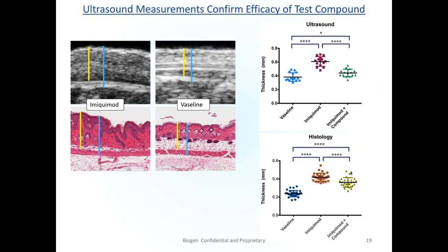But I think intuitively, the fact that we're looking at living tissue measurements successively over time across a number of animals, the measurement should represent the living state of these tissues more accurately. I guess that's about what I can say on that. So, okay. Great, thanks.